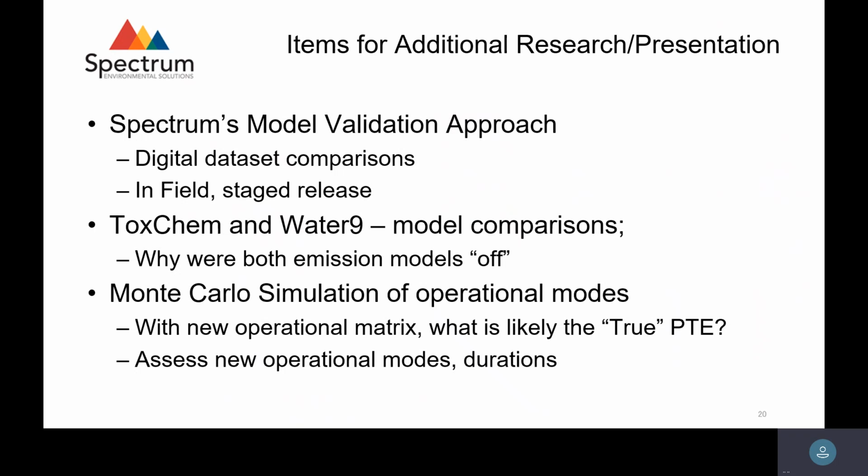We definitely learned some things are more movable in the data set than others. Some things really make a difference. Other aspects, maybe not so critical. Knowing the wind is amazingly critical in a tight space. All the other historical studies that are in the literature are giant, large, open agricultural fields, lagoons, wastewater pits that are ginormous. Here, we're doing very tight space.